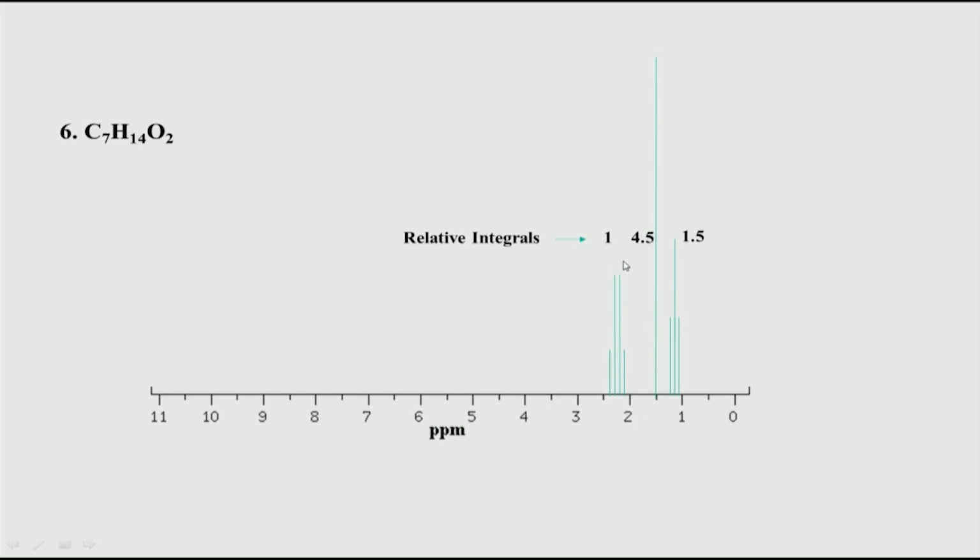Now, the question is how do you interpret this integral which is fractional. Remember, as we saw in the last class, in NMR all you get is what is called relative integration. Unless you take a reference and then calculate, quantify, you will get the absolute value, but if you look only within this spectrum, within this molecule, it is only a relative value which you will get. So, one has to take a judgment on how to analyze this.